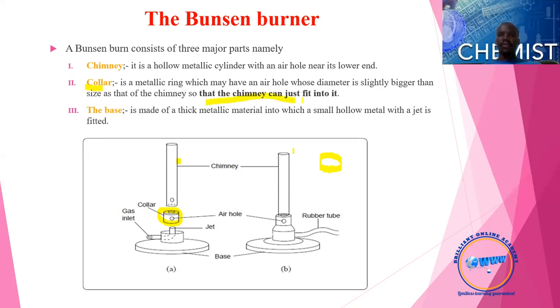Very good. Then we have the base. The base is made up of a thick material. The reason why it is thick is to make it stable. We'll be able to discuss the functions.